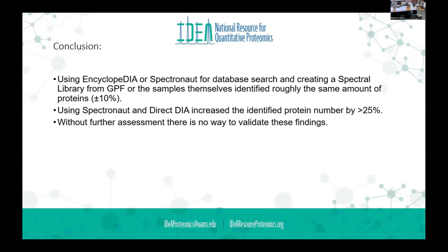But my problem with Spectronaut right now is trying to go from the peptide level back to the protein and how they're actually matching up their numbers. I can't backtrack it. You have to go peptide by sample by each individual protein. I even pull those out and try to do it the way they say they're rolling up, and it doesn't match. We've had the same experience.